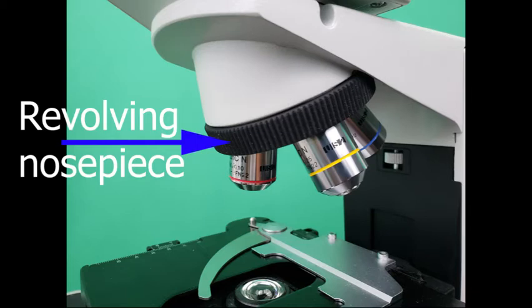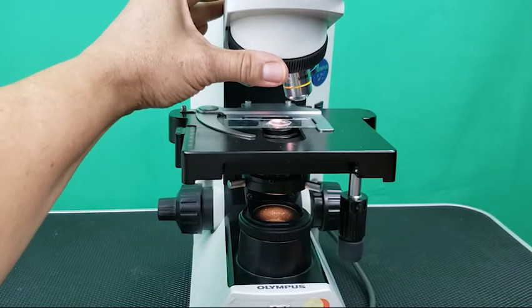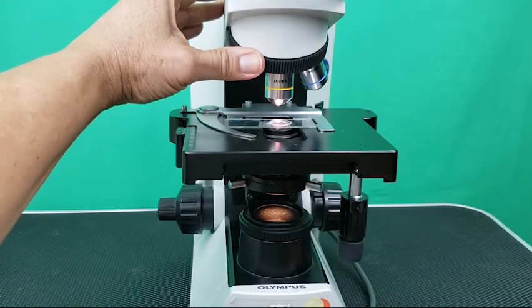Revolving nosepiece: This is a rotating nosepiece which carries objective lenses of different powers. The user rotates the nosepiece to change from one objective lens to another.